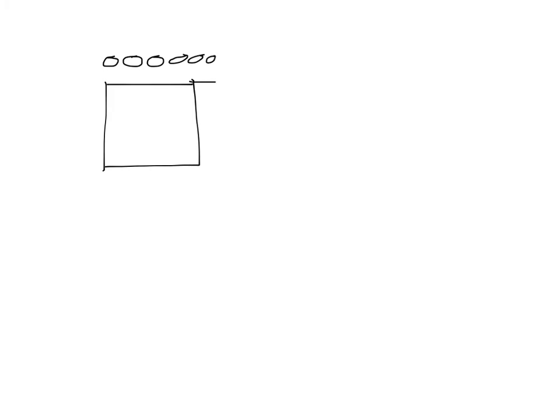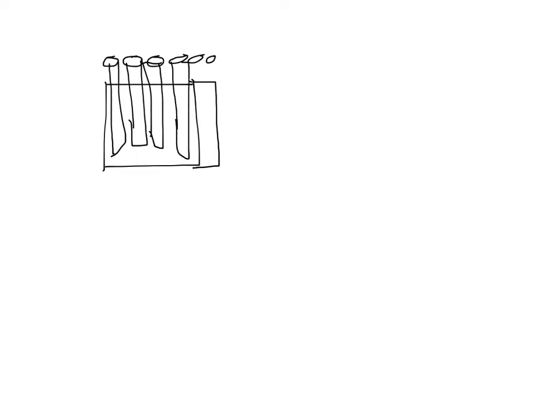6. Okay, make sure this test tube rack's a little bit longer. 6 test tubes. And excuse my drawing. What you guys need to figure out is what you're going to be putting in your test tubes.